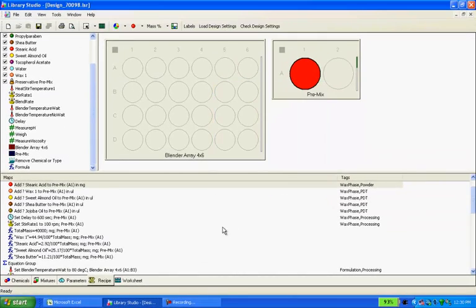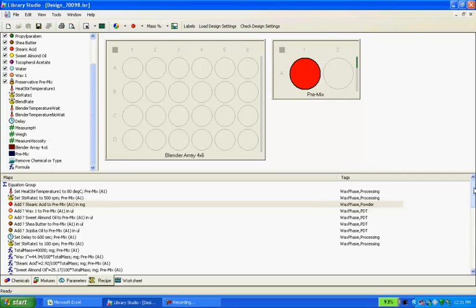So these functions and set of equations, and defining the map as exists, is a very powerful tool to have a set of predefined equations to determine the amount of chemicals that you would like to dispense into the library wells, as you can see from this particular example.